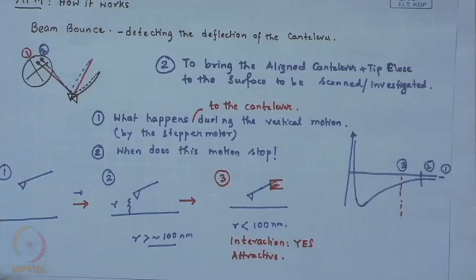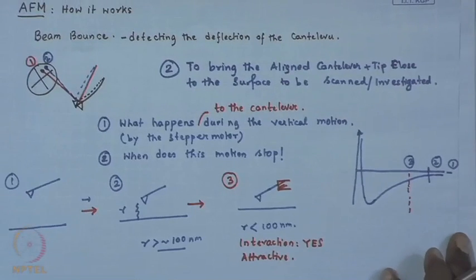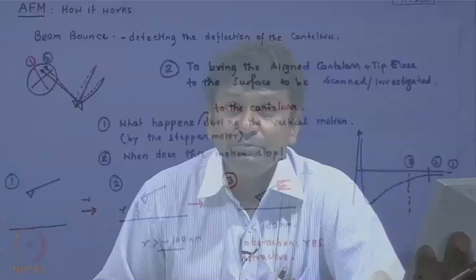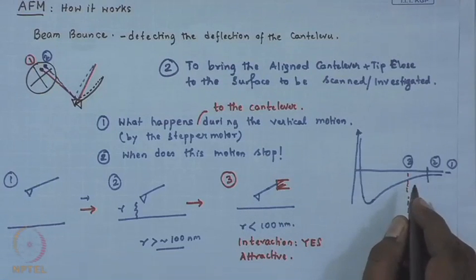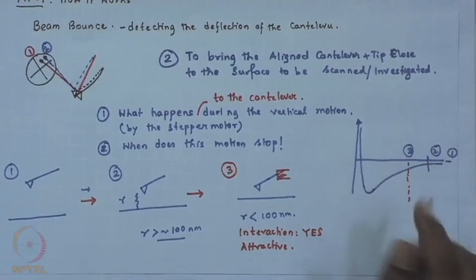We had argued that we will always go in for a soft spring or a cantilever with a lower spring constant. What does it mean, and how low is low? Essentially, it is in such a range that it deforms to these type of intersurface forces. So, you now have a cantilever which responds to these attraction forces.